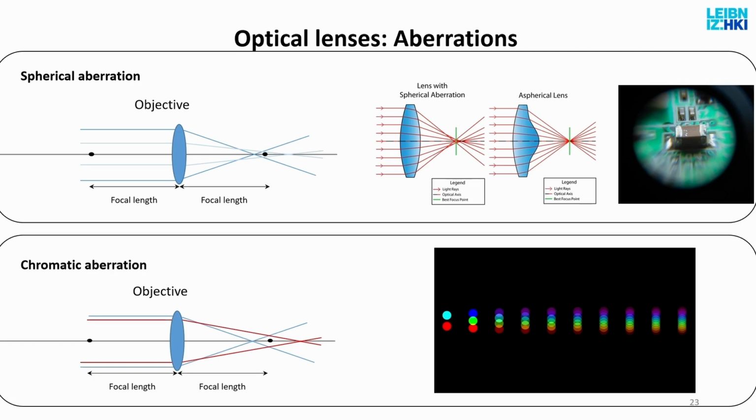But that's a big problem for biologists because then you say, my nuclei are here, and my actin fibers are here, and my endoplasmic reticulum or mitochondria particles are here. I labeled one in blue, the other one in red, and I need to know, are these mitochondrial particles traveling along the actin fiber, which makes more sense. It doesn't matter. Point is, I want to see if they overlap. But if I have this phenomenon, I cannot say if they overlap, because they will not overlap even if they do in reality, because the lens has chromatic aberration.